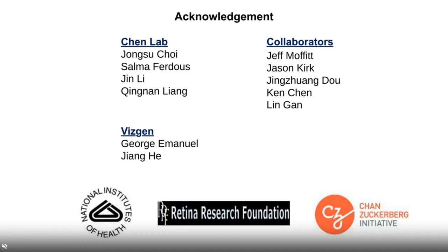Sure. Thanks, Dr. Chen. You hit the point very well already. I just wanted to extend by mentioning that MERFISH is actually built on single molecule FISH, which is an in situ hybridization method already. However, we do have something called error-robust barcoding. What that adds is that if you do single molecule FISH imaging, there's a chance that the probes, due to unspecific binding, will give false positives or false negatives. However, by using this binary barcoding scheme and assigning each RNA transcript a defined barcode, even if there is some error due to unspecific binding or loss of signal, there are ways for us to detect the error and correct it, and that makes the measurement very, very accurate.